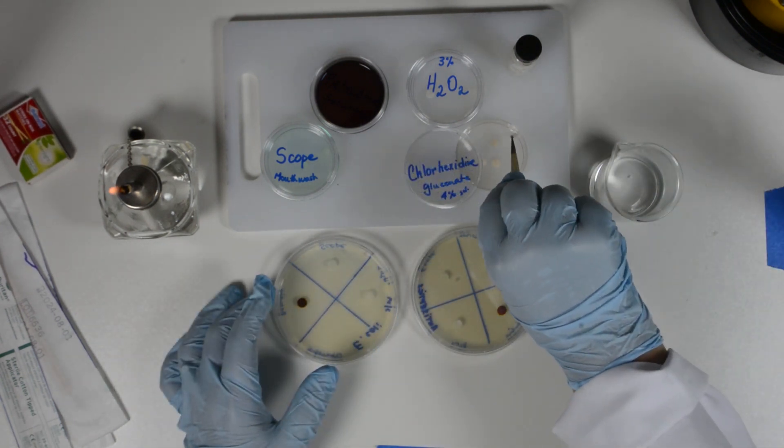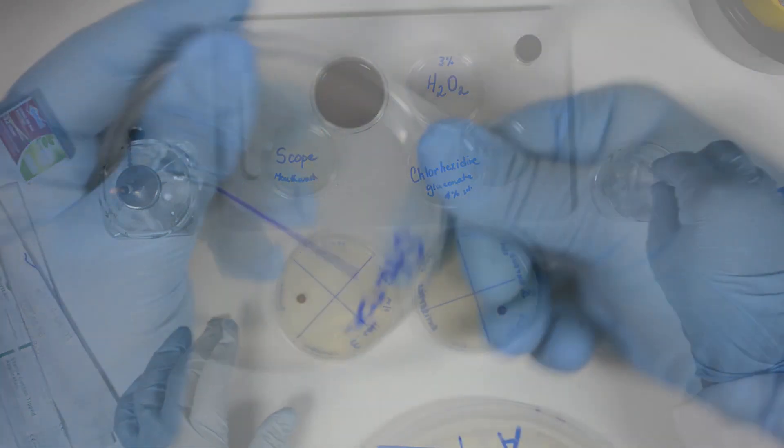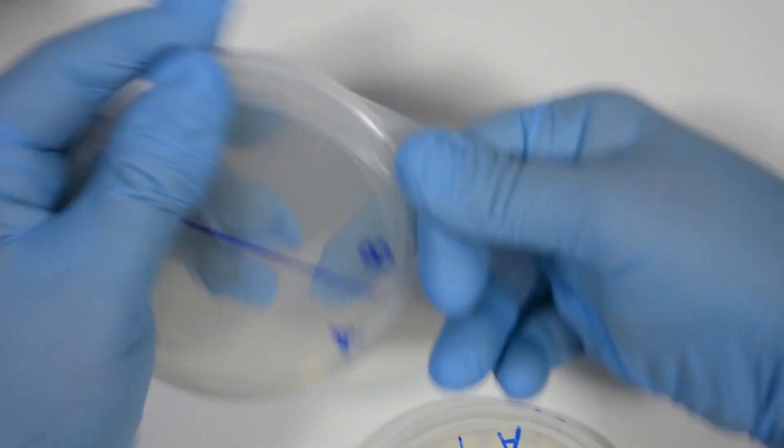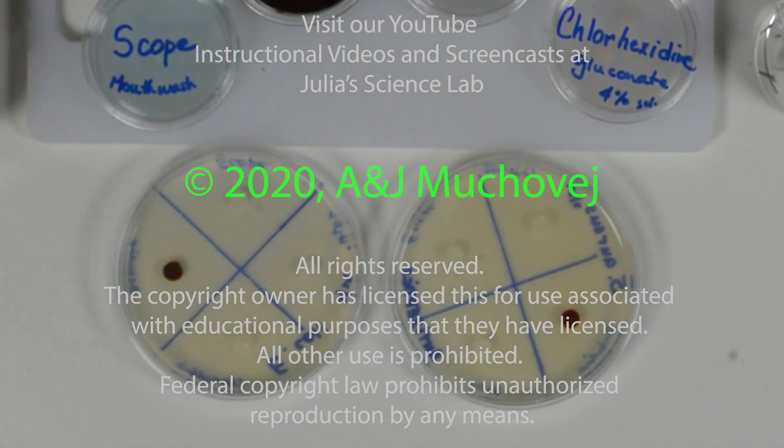Repeat until all four chemicals are in place for the two pairs of plates set up. Seal the plates with parafilm, invert them, and incubate at 35 degrees Celsius for 16 to 18 hours.